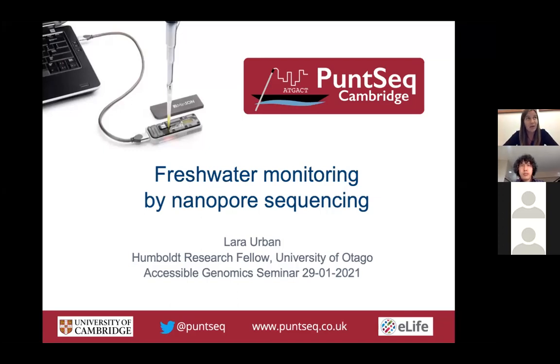It's now 3 years ago, I think, to find out how we can use nanopore sequencing for freshwater monitoring. And as I said, it was really just a project led by PhD students, and we acquired funding from the University of Cambridge, and we acquired a BBSRC grant, but in general we had quite little funding, all just startup grants that we used.